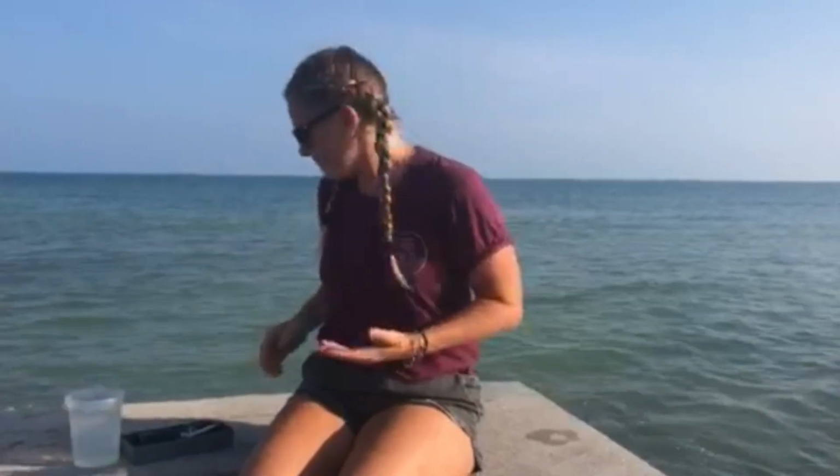As you know, a lot of people haven't been out, there haven't been as many boats out, and in Key West there haven't been any tourists as well. So we're going to see if the water might be a little bit different, maybe a little bit healthier. So the first thing we're going to do is use our refractometer.